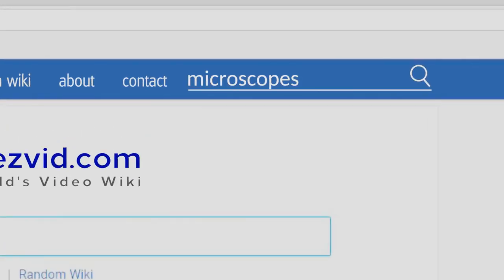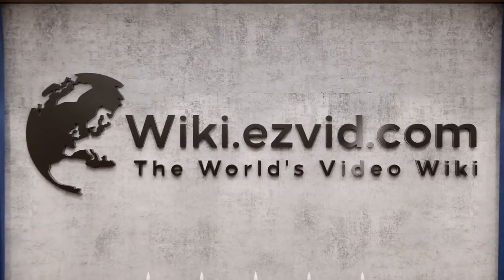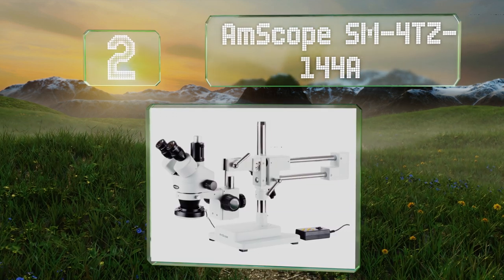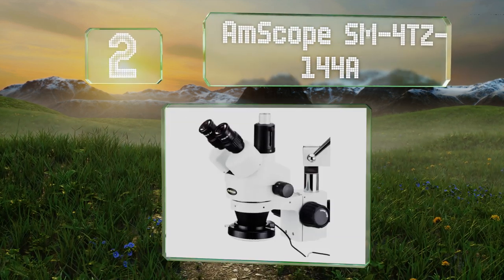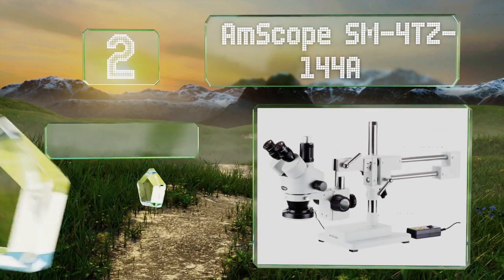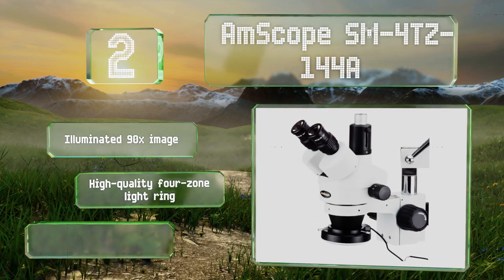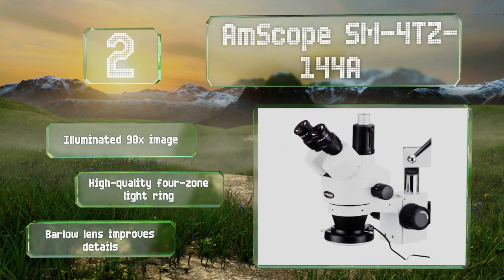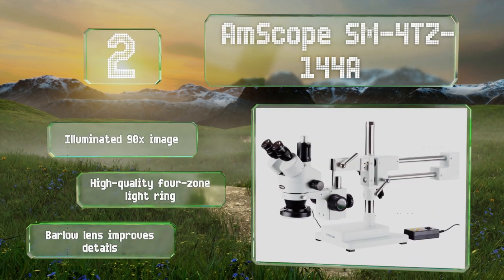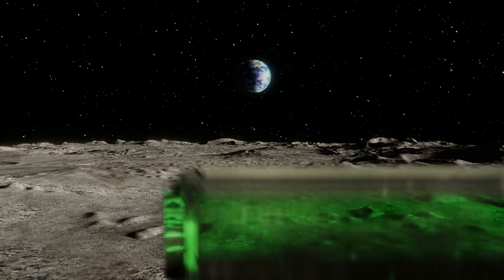At number two, the AmScope SM40Z-144A is a professional grade apparatus that consists of trinocular stereo zoom technology as well as a double arm boom stand. If you need to study a large sample that requires minimal handling, choose this one. It provides an illuminated 90 times image, a high quality four zone light ring, and a Barlow lens that increases detail.